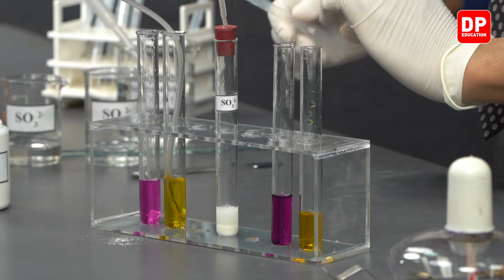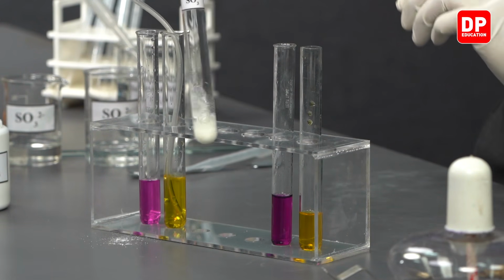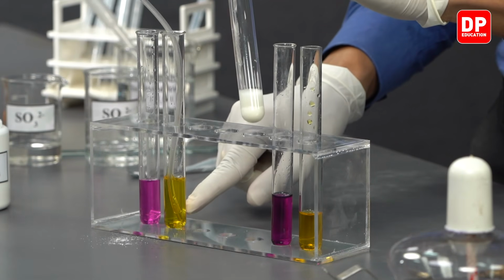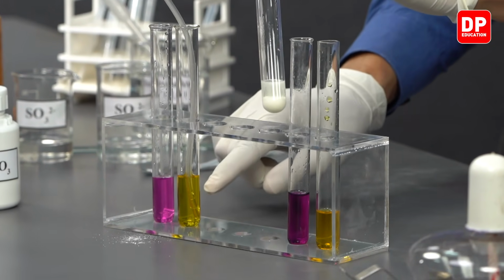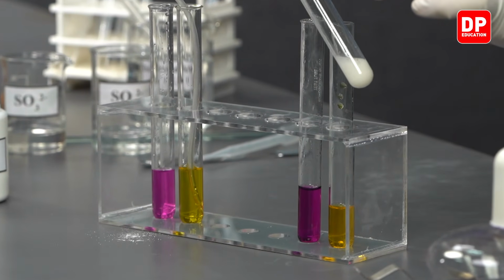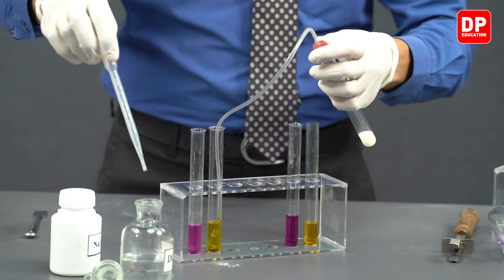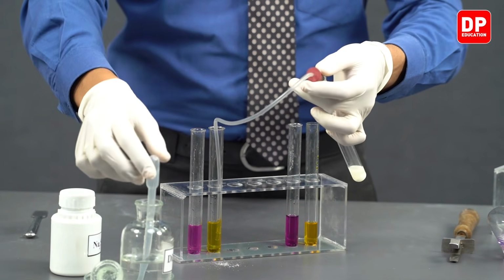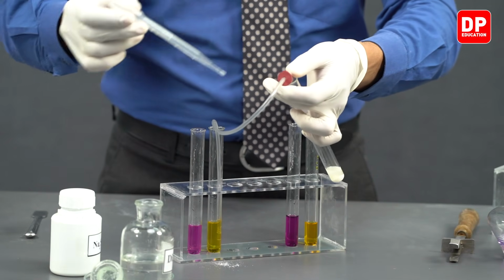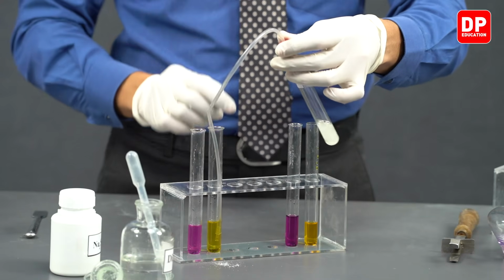You can see a gas was produced, and that produced gas is now sent through the acidified potassium dichromate solution. We can continue to add a bit more hydrochloric acid, so we will take the same dropper and add a small amount of HCl and quickly close the rubber stopper.